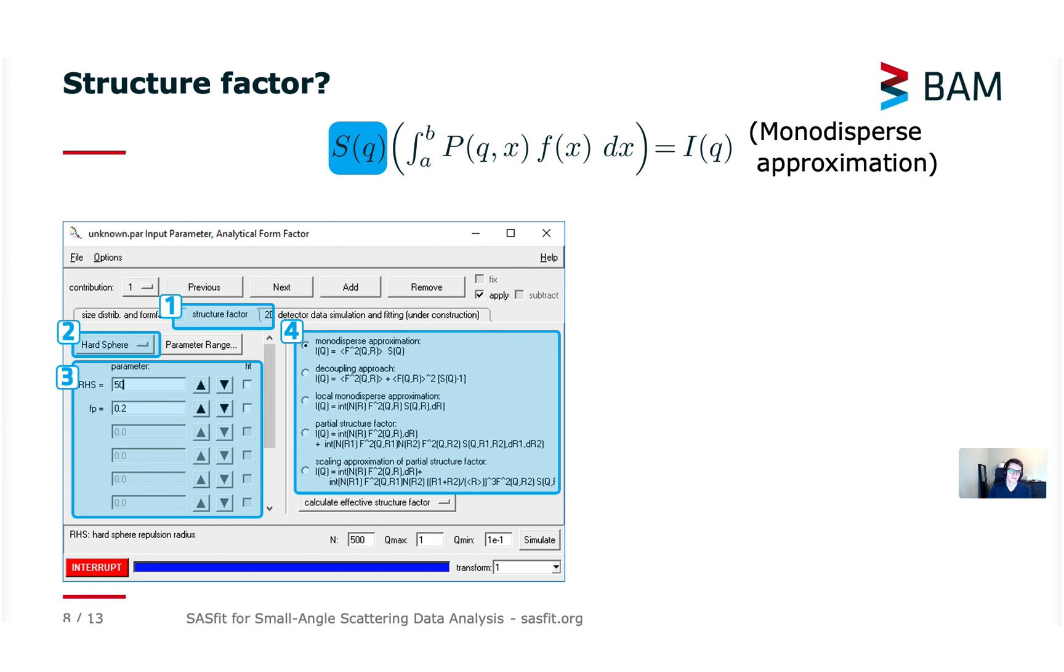For example the decoupling approach next to the squared and averaged form factor amplitude it requires also the non-squared averaged form factor which is not always implemented for every model. So then the formulas you see there's a form factor squared and averaged and also a form factor averaged and then squared. This non-squared form factor needs to be implemented in each model and if it's not available you will typically get an error message. Just to let you know there are some requirements connected with each method of structure factor incorporation.